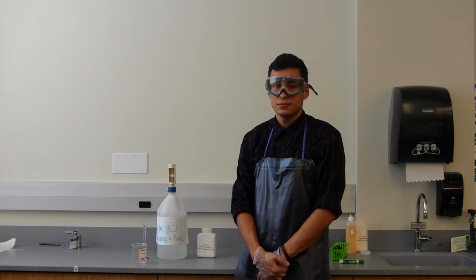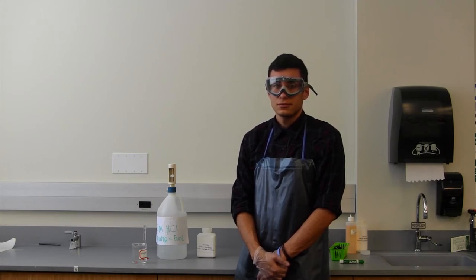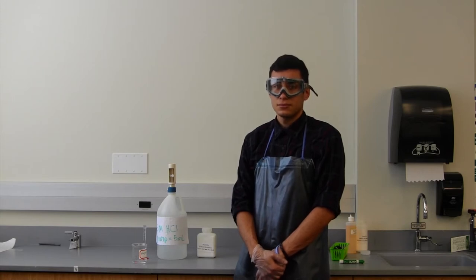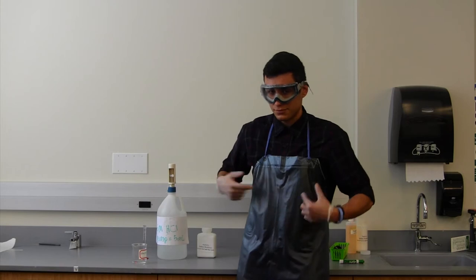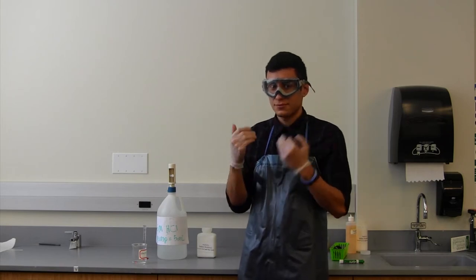Before carrying out any lab procedures, be aware of the potential safety hazards and equip yourself with the correct safety gear. For the purposes of this video, we will wear all safety equipment provided in the lab, including goggles, lab coat, and gloves. We recommend you utilize all available safety apparatus.